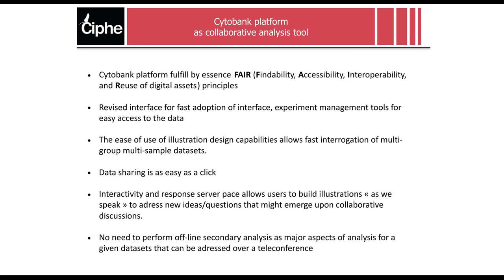The experiment management tool, as you have seen, really improves the efficiency of accessing the data and finding really important experiments. You've seen the use of illustration has been rethought, so now it's very easy to design illustrations on multi-group, multi-samples, and interrogate part of the data set using dynamic filters.